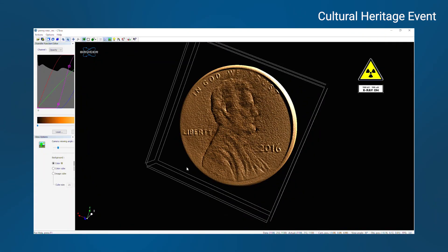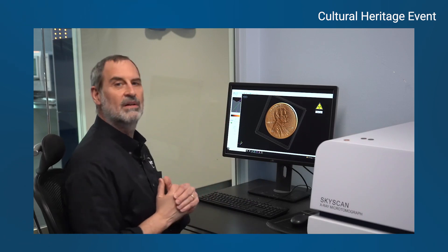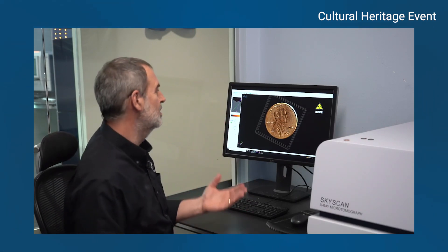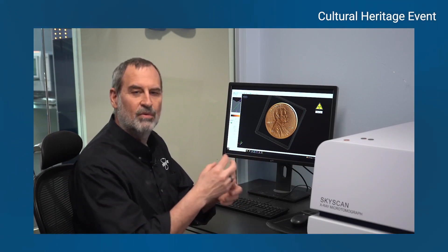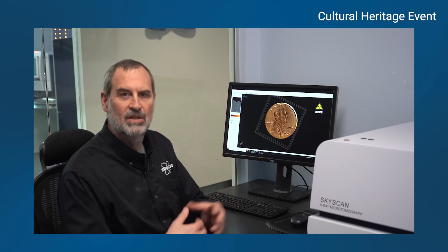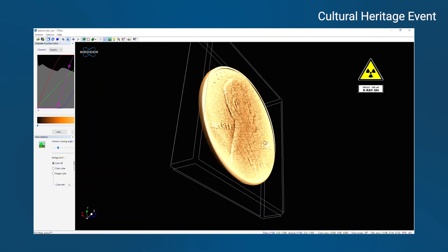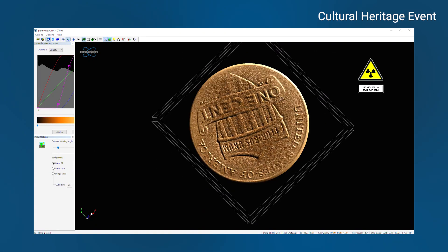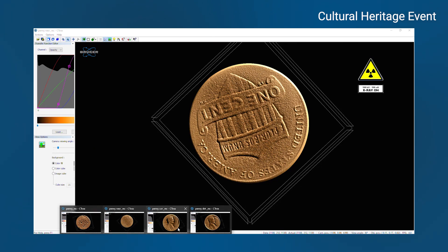That is our brand new penny — it looks good, it's shiny. The color is actually artificial; I can set the color to anything I want. You can use color to enhance various aspects of the sample — for a piece of rock with various minerals in it, you can color each mineral to see where they are, and use that in a data analysis program to characterize and calculate how much of each mineral is present. This one is pretty boring — it's a brand new penny with the new chevron design.